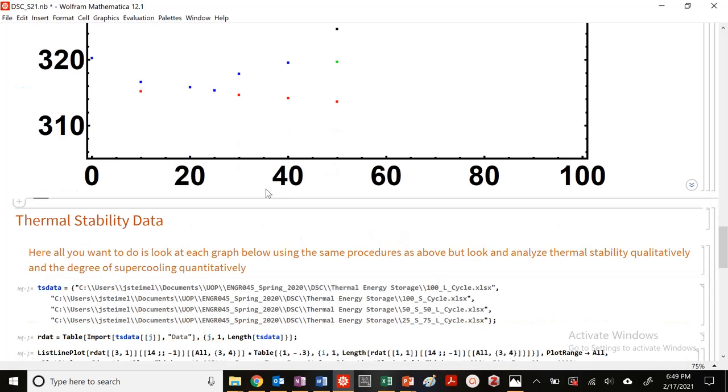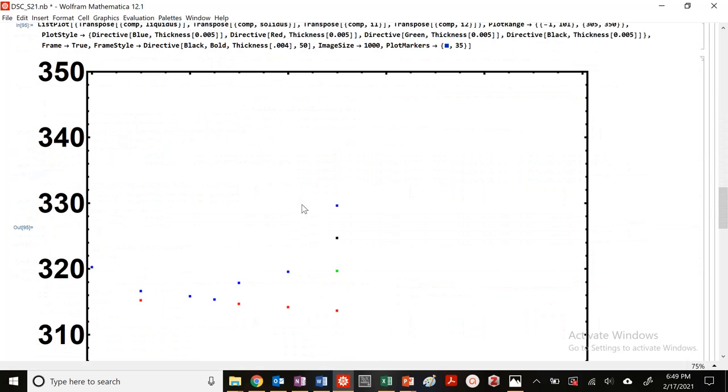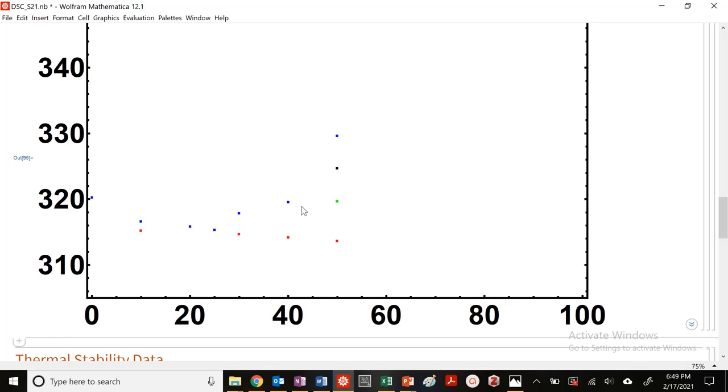So this is fantastic. And then again, you want to build a phase diagram. We want to kind of pick an application and then see what are the thermal properties, right? We want to look at what is the enthalpy of fusion? What is our melting temperature? The melting temperature is the most important for these applications. So once we pick a melting temperature, that determines our phase change material, our PCM material. So it is going to regulate the temperature at whatever the melting temperature is.